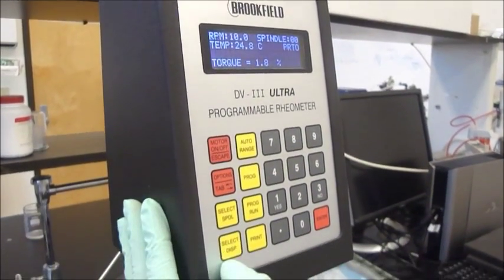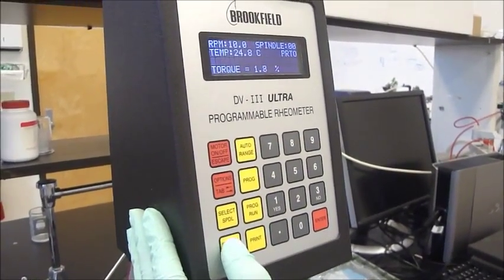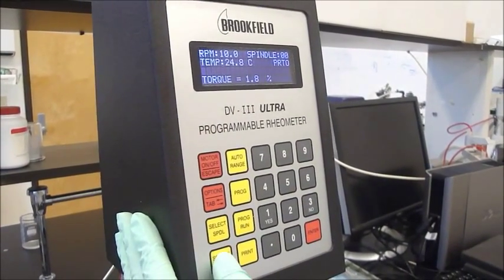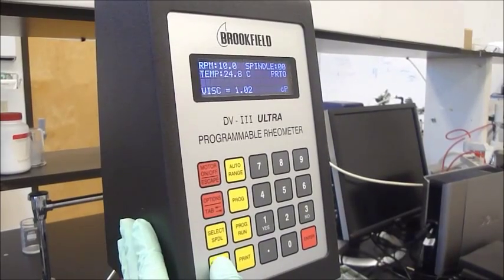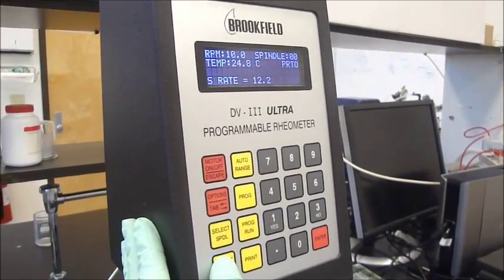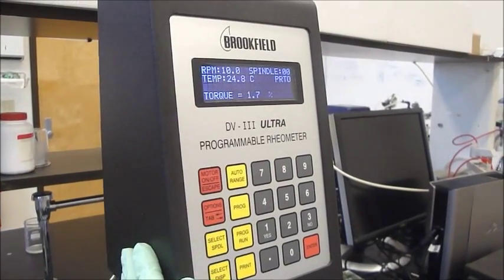By pressing the select display button, you can change the display from torque to viscosity to shear stress and shear rate. And then you go back to the torque.